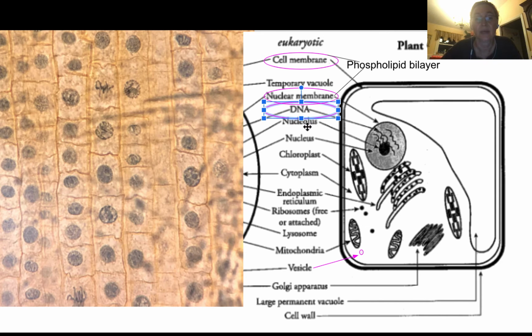Next, we have not talked about the nucleolus, and we're not really going to talk about it yet, but you can see it, right? Over here you see it's like a dark mass inside the nucleus. Hopefully in your pictures as well, you can not only see the different conditions of these nuclei, but some of them, like this one here, almost like a ghost-like dot.